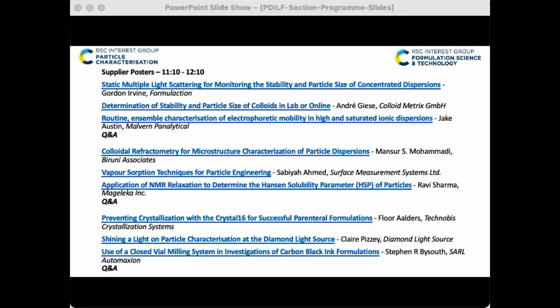I typically use the scintillation type of vials. Well, the vial I use generally is what's called an EPA vial. It's 27 millimeters diameter, and different heights give you different volumes. Smashing. Thank you. Good. Once we've got you on, you've got Stephen on, we've got some more questions for you as well.